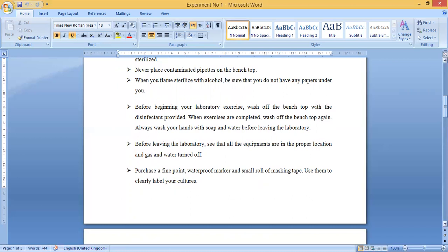Before leaving the laboratory, see that all equipment is in proper location and that gas and water taps are turned off. Whenever you are leaving the laboratory, turn around and check all things — ensure all lights are off, all fans are off, all flames are off, and all containers of poisonous material like acids are properly closed.